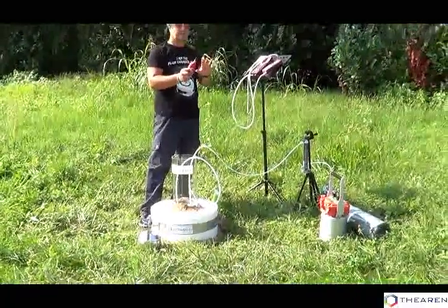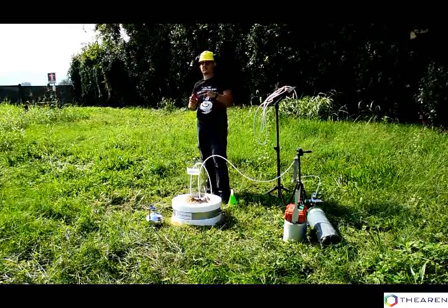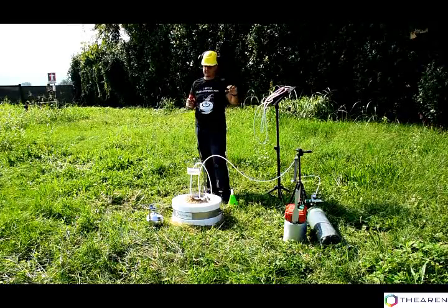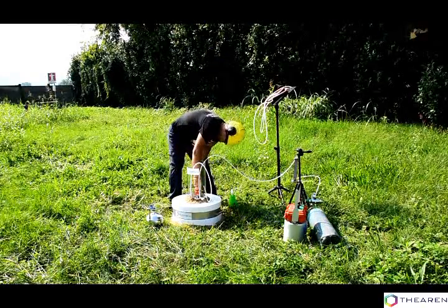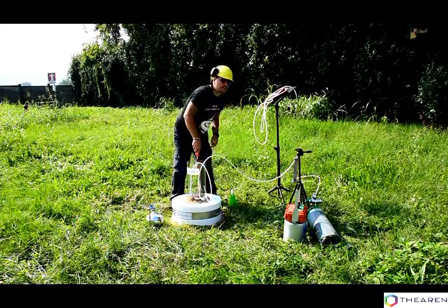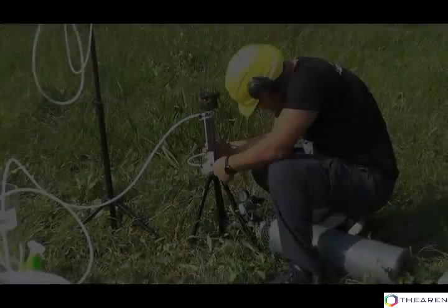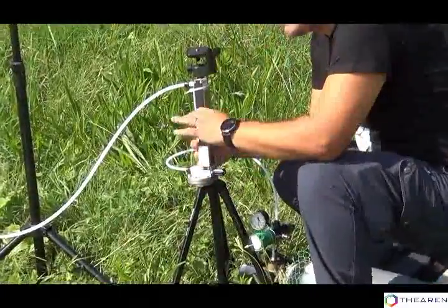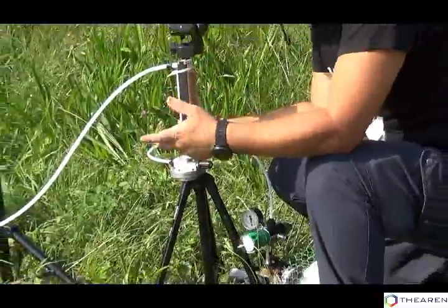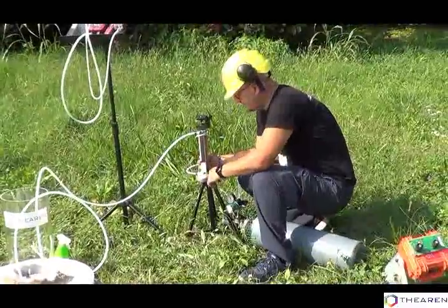It is also necessary to measure the temperature and humidity inside and outside the chamber. Normally, even in very critical conditions, the opaque PTFE material, of which the chamber is built, maintains the same temperature inside the system, avoiding harmful greenhouse effects. Remember to periodically check the nitrogen flow during sampling, since the flow value is one of the fundamental parameters for the calculation of the emission flow rate of the chemical compounds monitored.